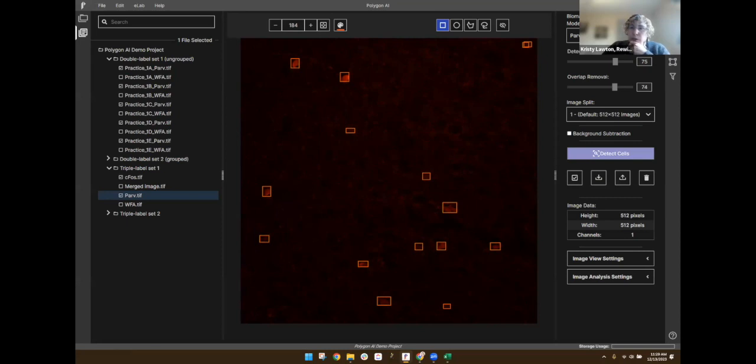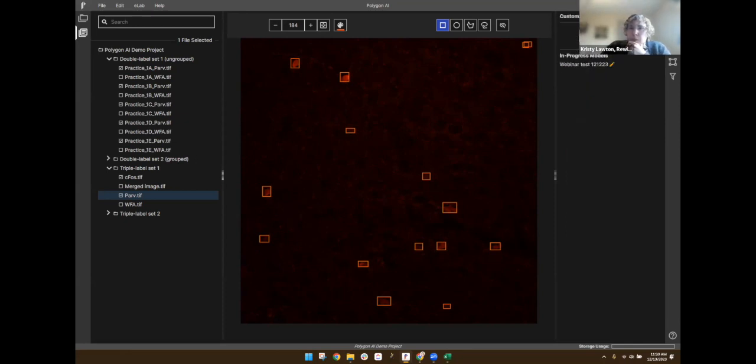So you'll see there's several types of analysis buttons over here. Again, I don't have time to go into all of these today. I'm just trying to cover the most important, useful ones to get people started. And then, so we go into custom models, and here you can create a new model here.